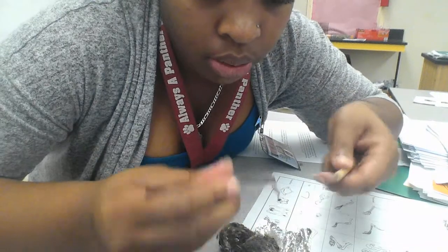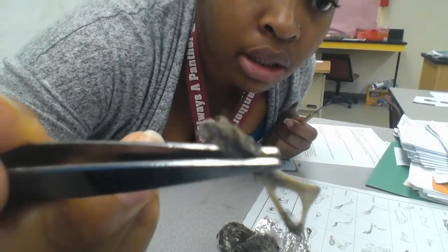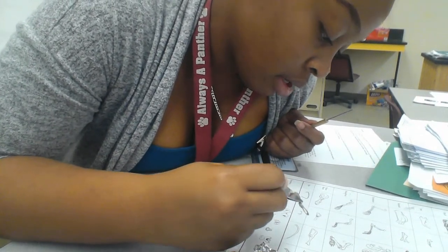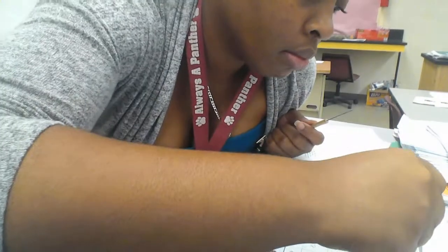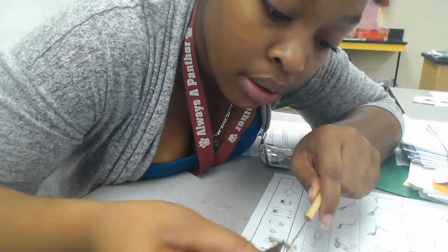Here's an interesting looking one. All right, and that, my friend, looks like the pelvic bone of a mole. Going by the front right now, it looks like this guy eats a lot of moles. What else we got? Oh, we have so many bones in here, I'm not gonna lie to you. All right, here's a shorter bone.